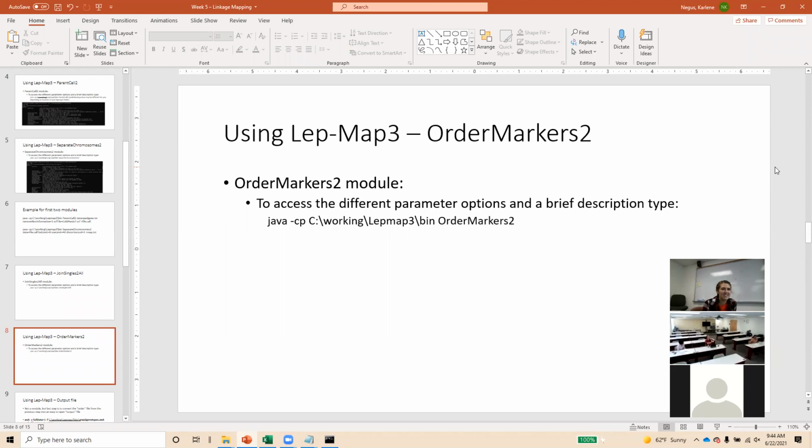But my question is, how do you figure out things all by yourself? Well, I didn't do it all at once. I started out, I learned how to use JoinMap, and then it's a lot of work. Bit by bit, each of those, was it 5 modules or 5 things you go through? So you spend some time in each of those as you go on to the next step. At the very beginning, I set almost everything to default, and it just takes a little while to learn what they do and how to tinker with it.